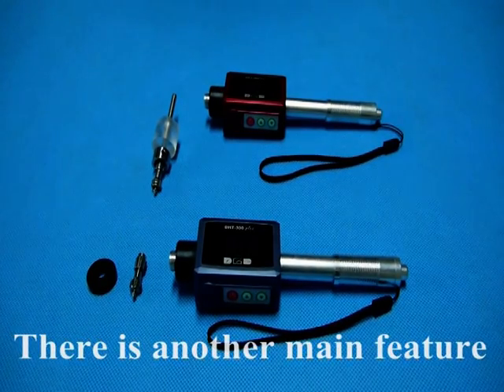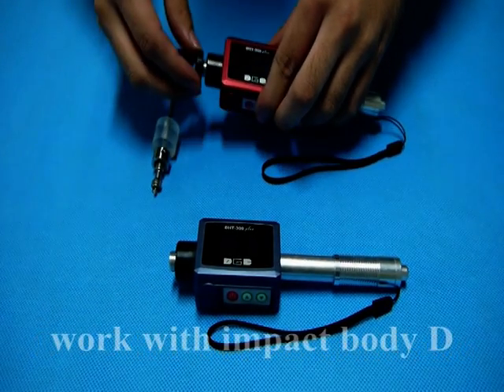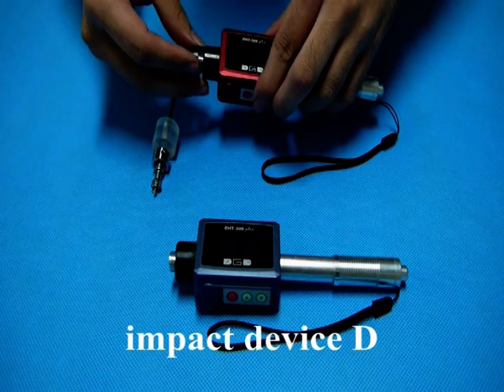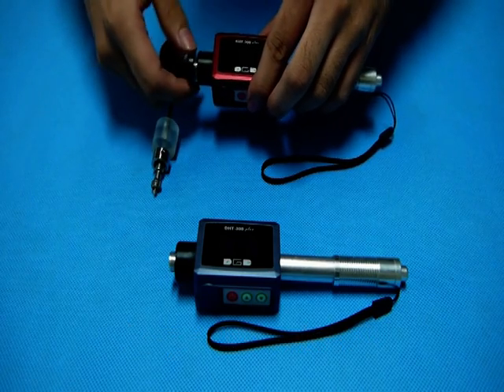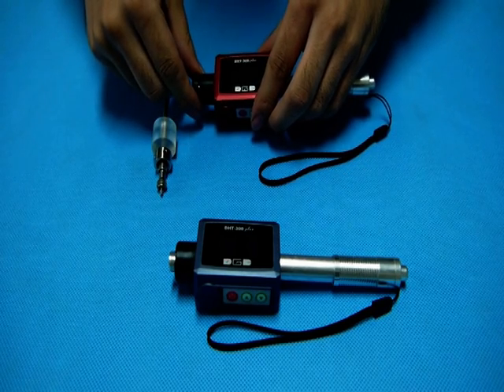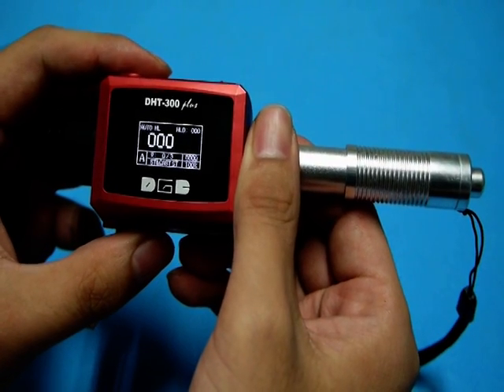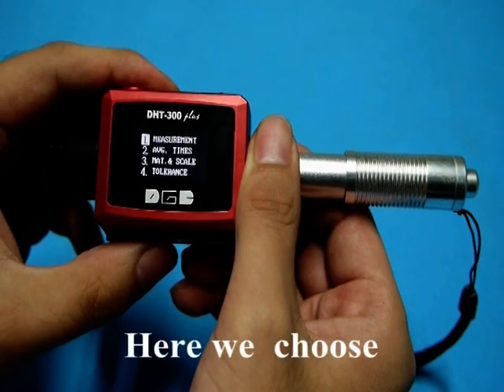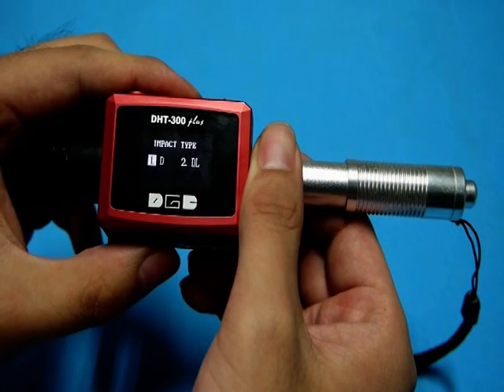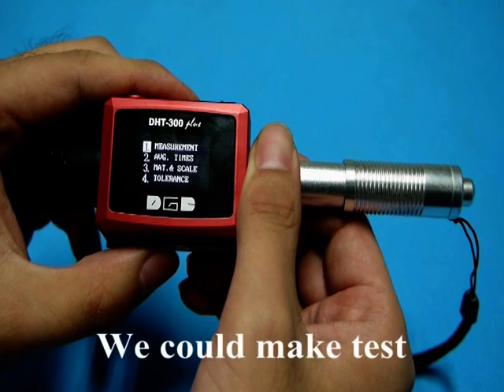There is another feature here. Our DHT300DL could also work with impact body D and with the function of impact device D. Here we choose the impact device and choose D. After that, we could make the test on the block.